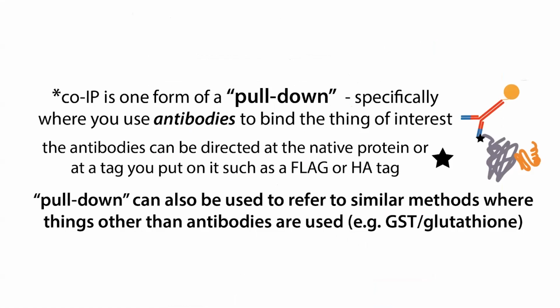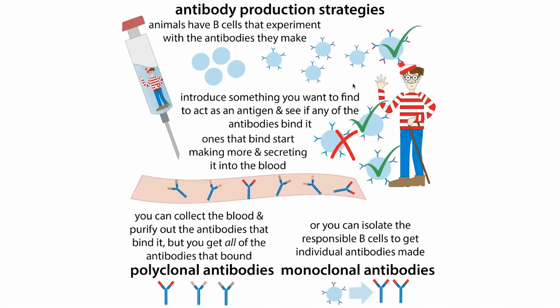This is really important because not all proteins have good antibodies available to buy. And even if they do, they're typically really expensive. More on this in another post, but basically everybody's looking for different proteins. These antibodies can be hard to make. They often involve the use of animals, very expensive types of things.